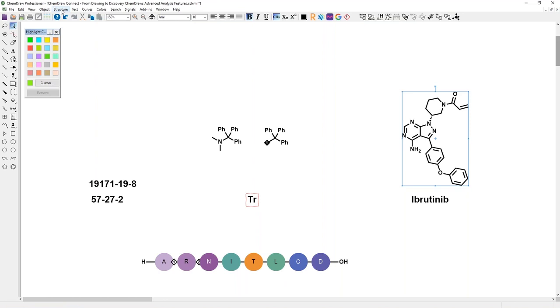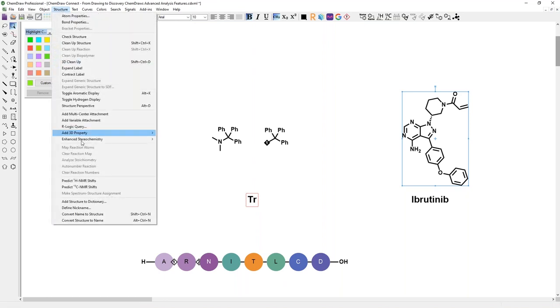If you don't have that displayed, you can always navigate to structure and then predict proton or carbon NMR over here. There's another question around Helm, I think that just came in, if that could also be used for metal organic frameworks. Honest answer, I don't know.